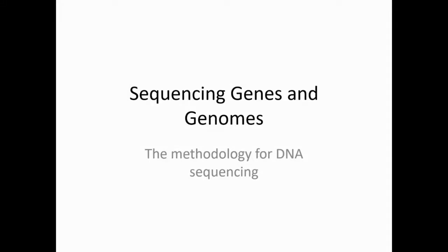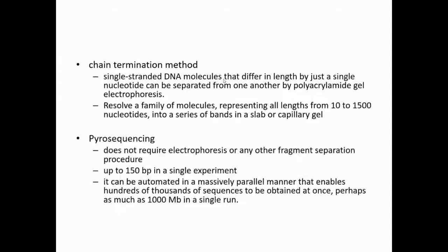Today we will discuss sequencing genes and genomes, and I will introduce all the techniques that have been used for DNA sequencing and also the latest developments in DNA sequencing. For DNA sequencing, the fundamental principle is DNA synthesis.